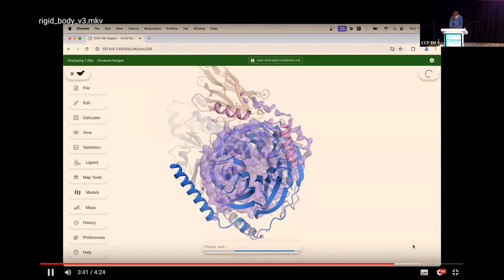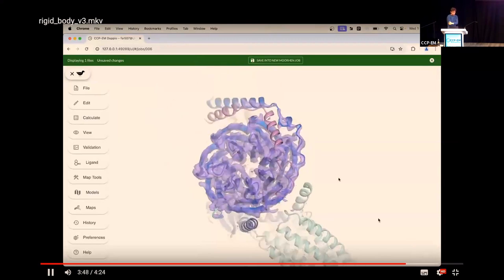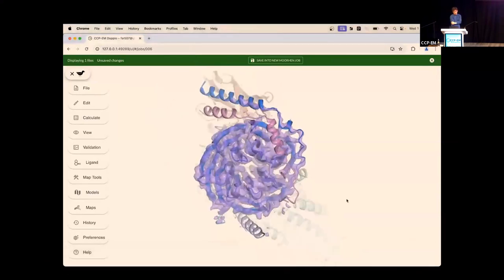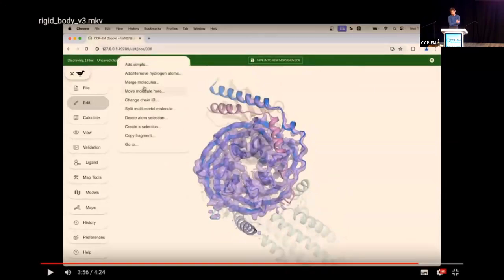Should be somewhere around here. Yeah. So it takes a while, but it does a good job. So as you can see, it fitted the model. It fits very well. A few things that you could do now, for instance, you could try to refine that helix, or maybe try to chop out the parts that have low pLDDT, but essentially we're done here.